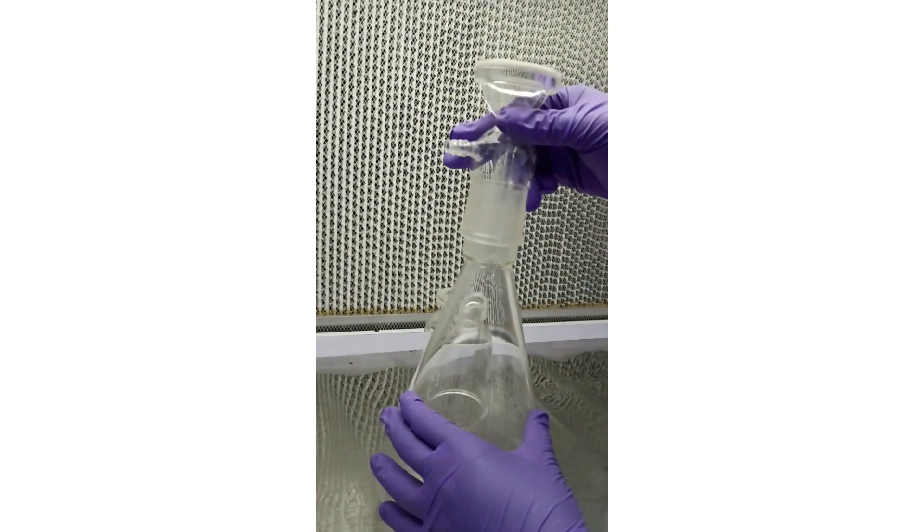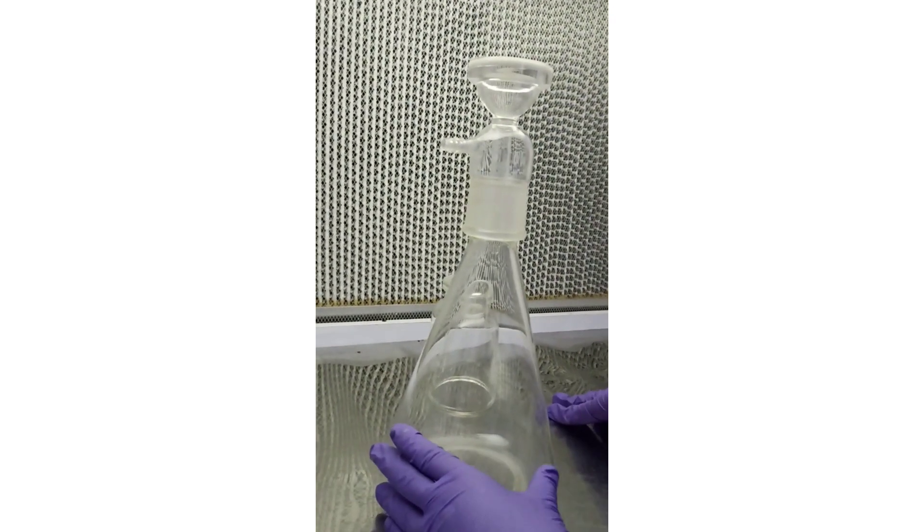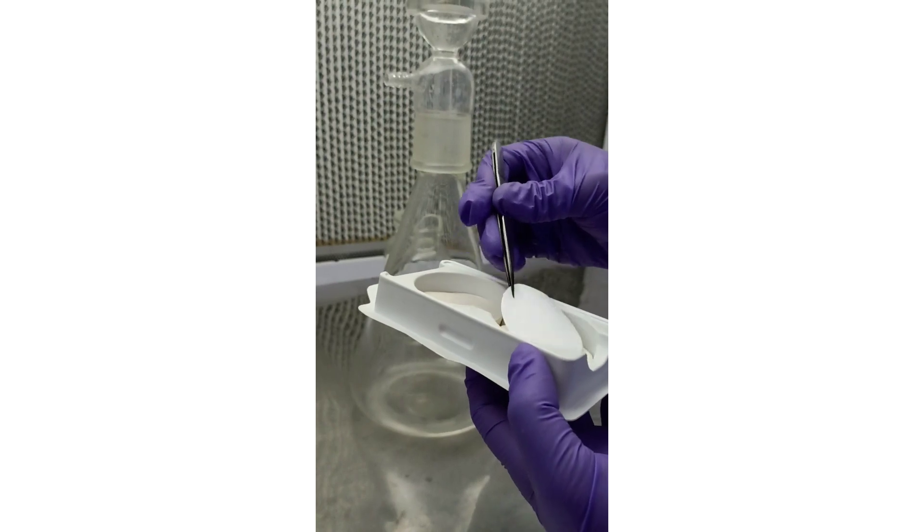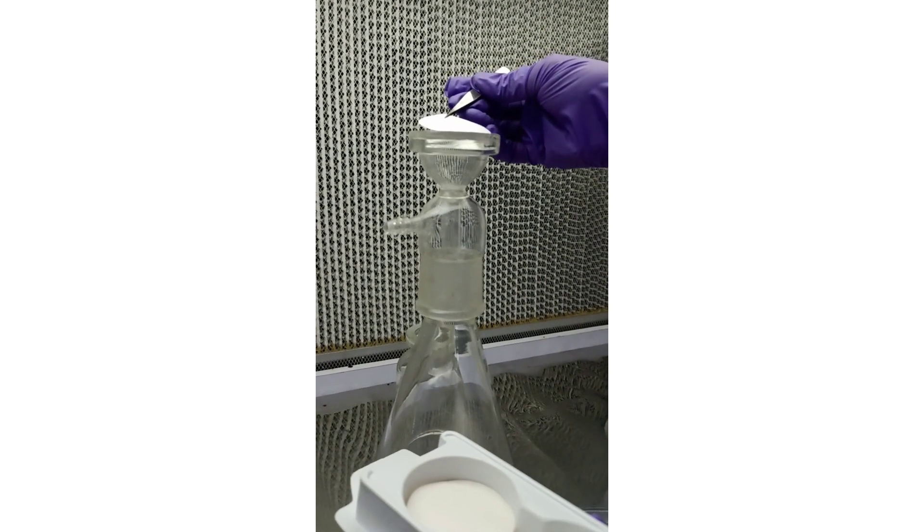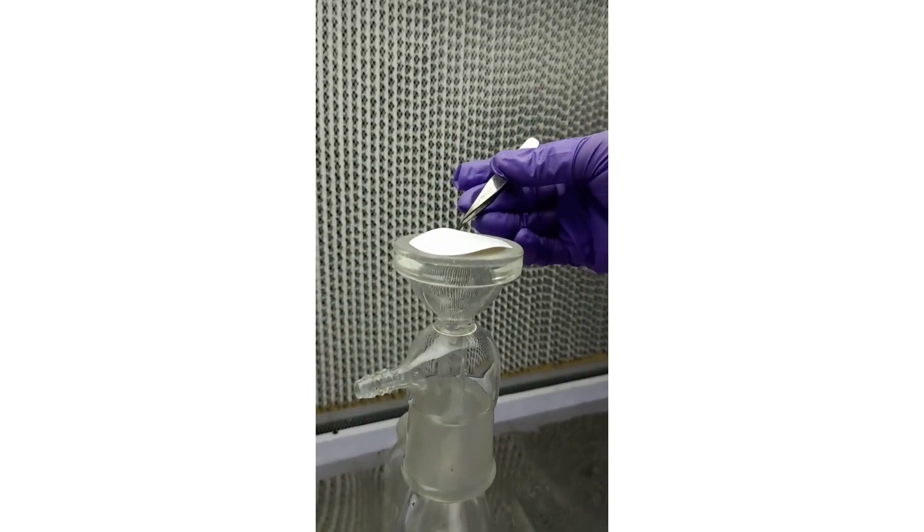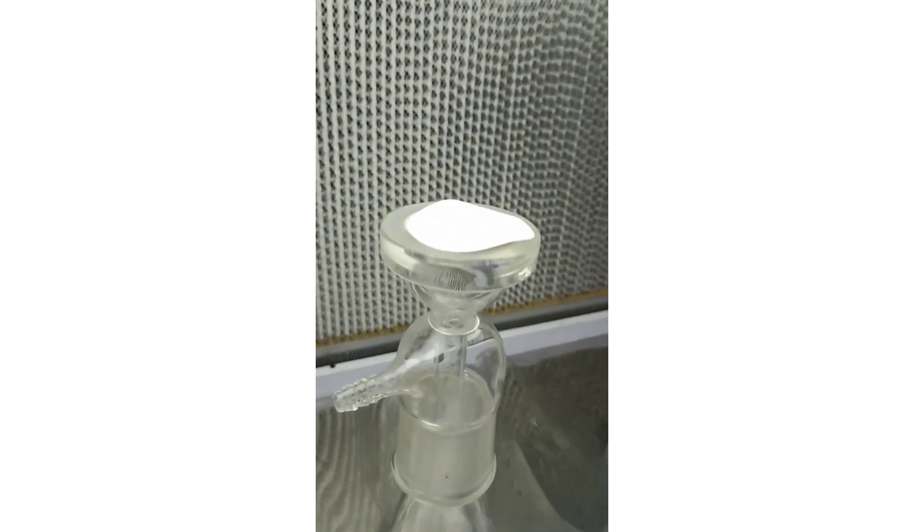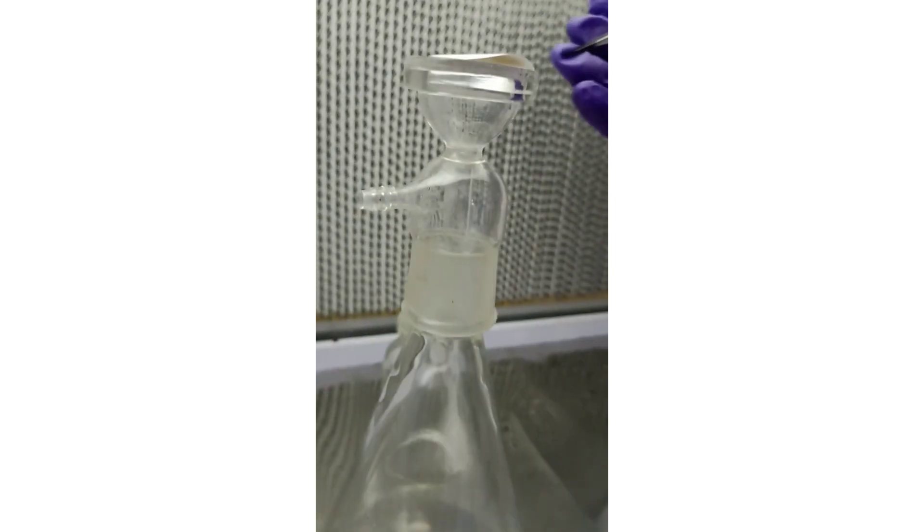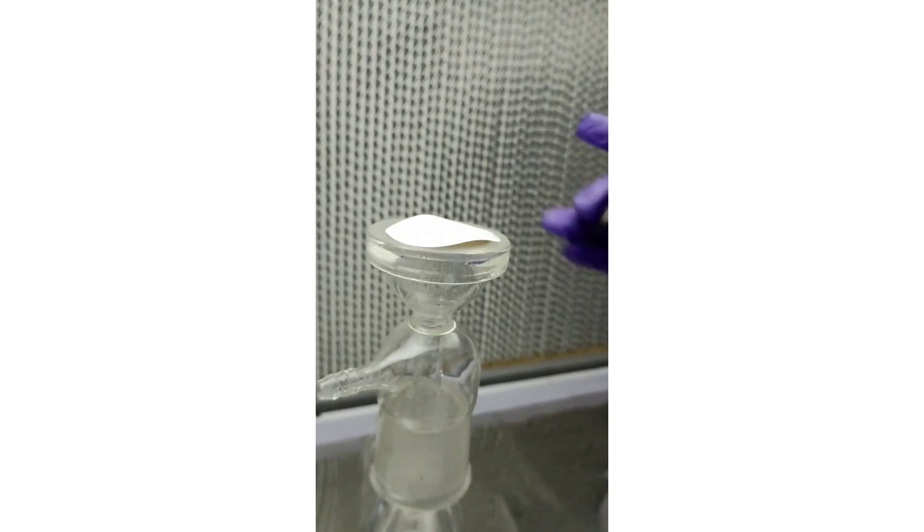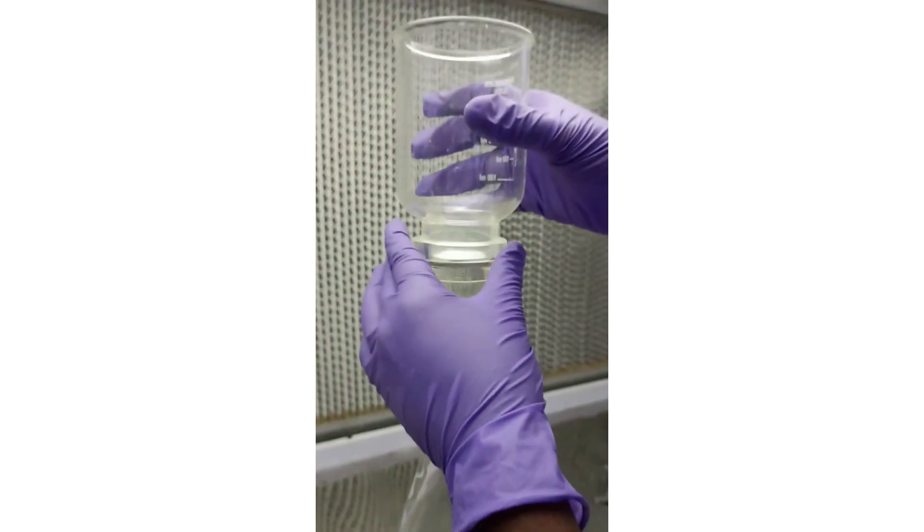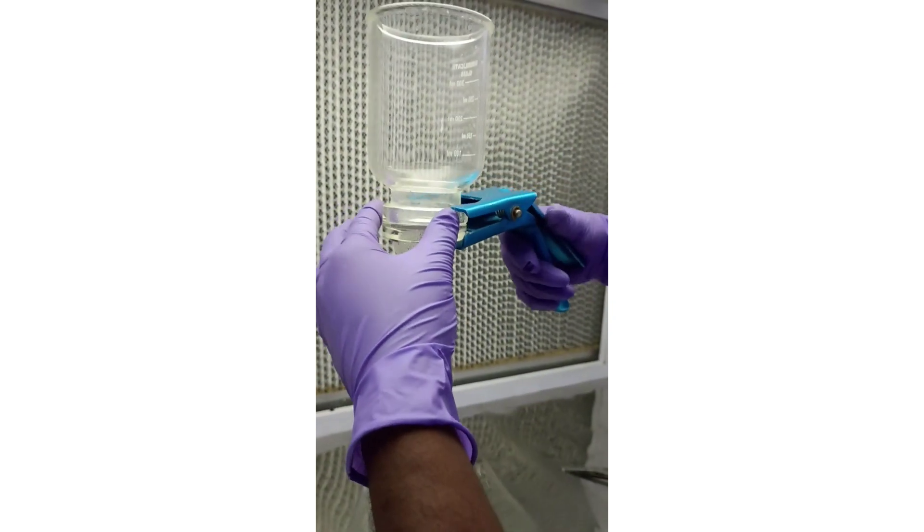After autoclaving, arrange the membrane filtration apparatus. Attach the middle part (the base) with the collector flask and place the filter paper on it properly with the help of sterile forceps. After placing the filter paper, place the upper part (the funnel) properly onto the filter paper and fix the parts using a clamp.